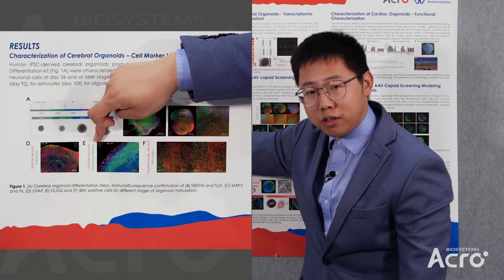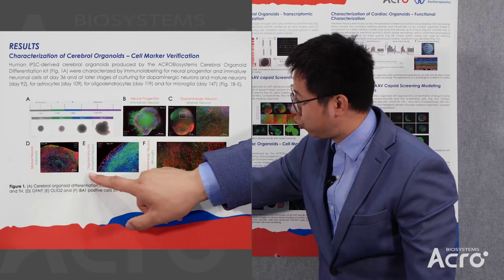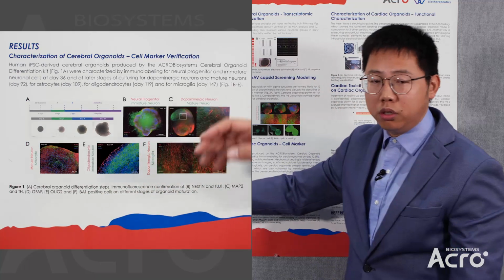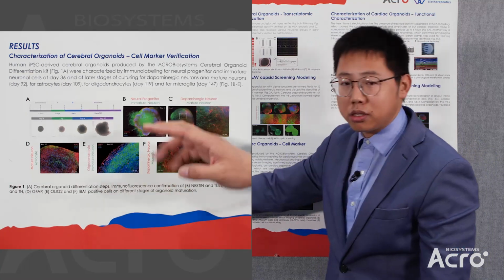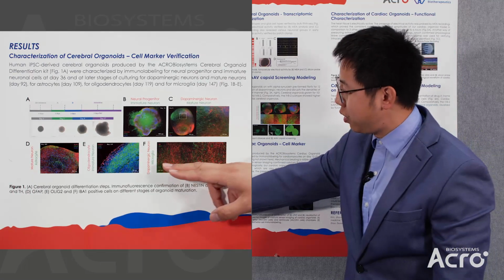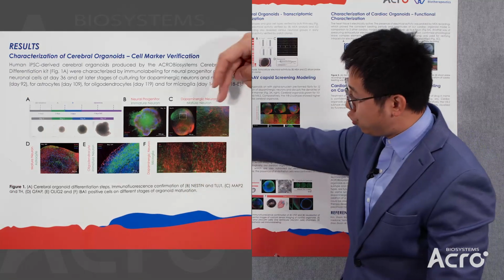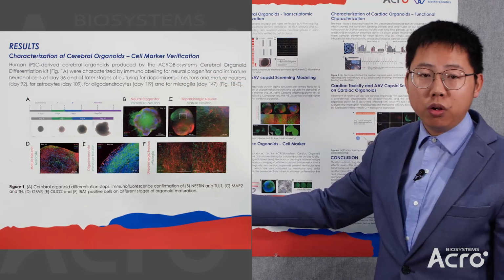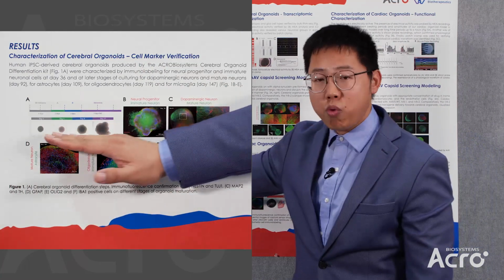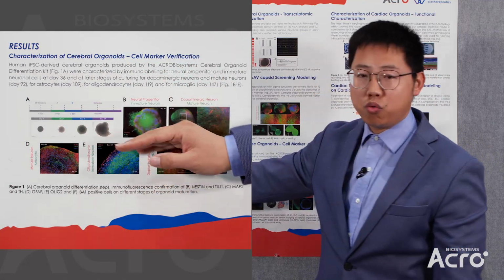Then let's look at the later phase. Besides astrocytes, we show oligodendrocytes with staining for OLIG2, to show that specific cell type. Additionally, for the dopaminergic neurons, we stain with tyrosine hydroxylase, and to show microglia. Overall, phase 1 shows the progress from human-derived iPS cells to cerebral organoids.